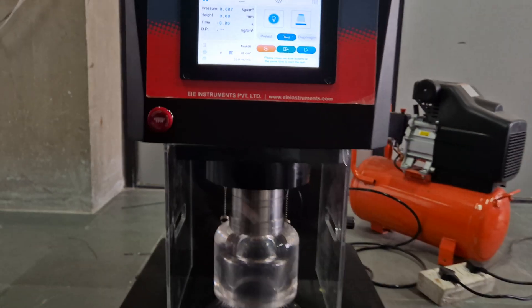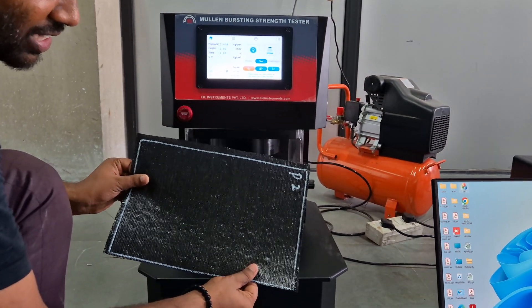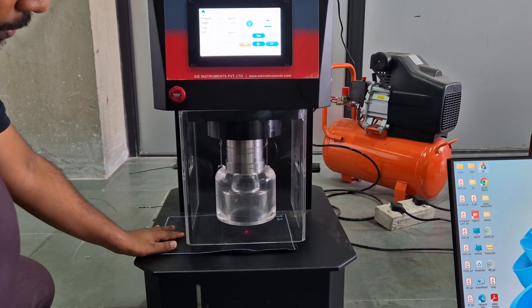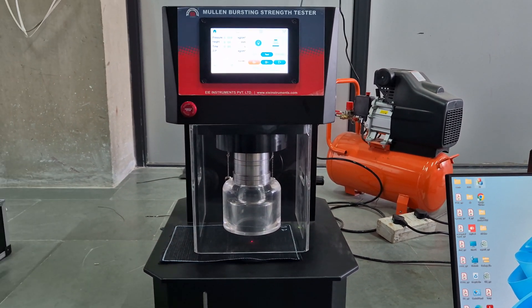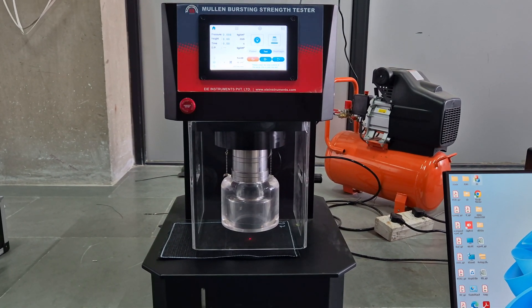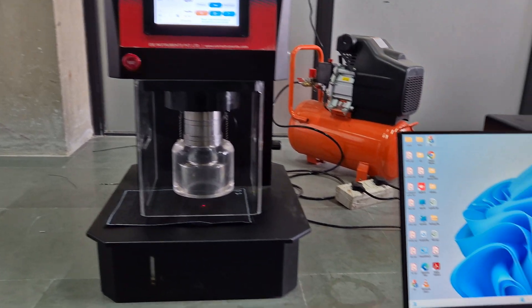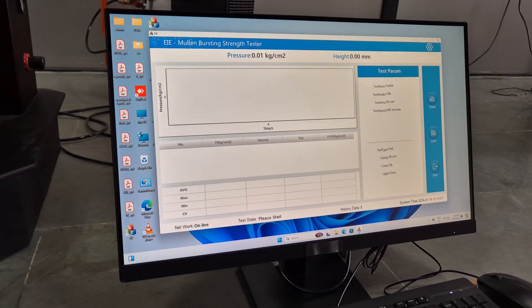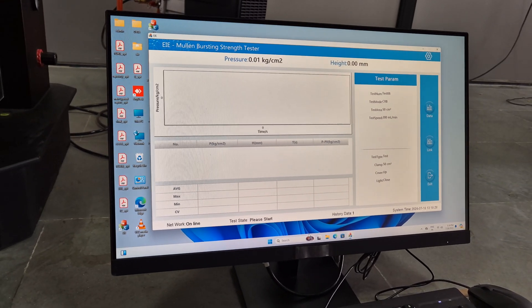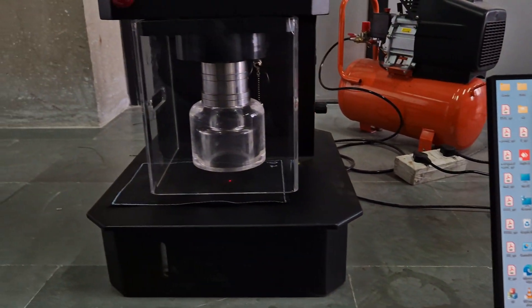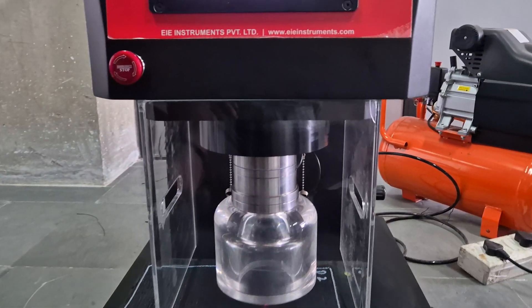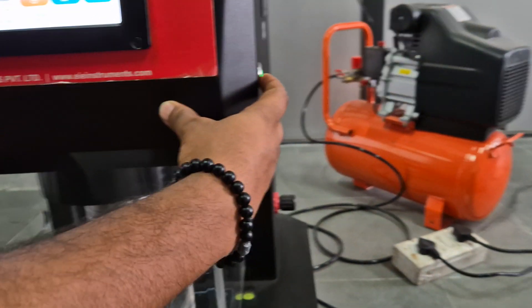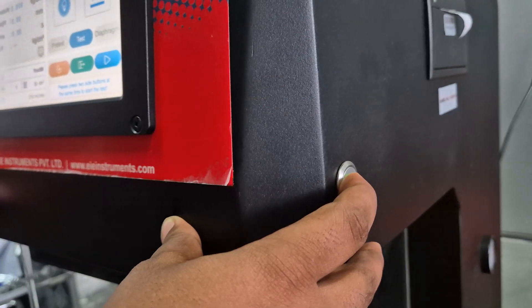Now this is the new textiles icon — we will place here. This is the software for data. To start the test we have to press this side button.